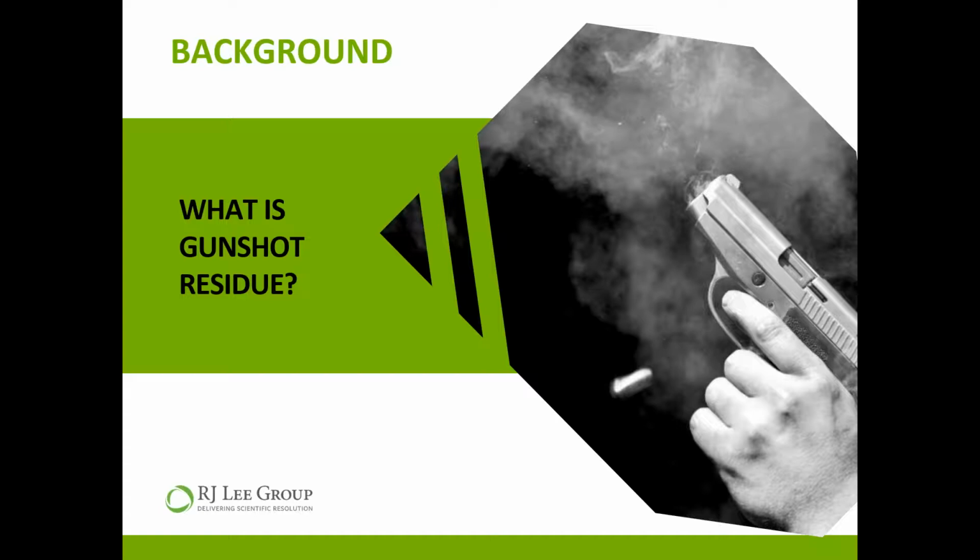So gunshot residue is really an umbrella term that includes all of the particulate and all of the material that comes out of a firearm whenever it's discharged. You can see all of these vapors coming out in this fabulous picture we have there.